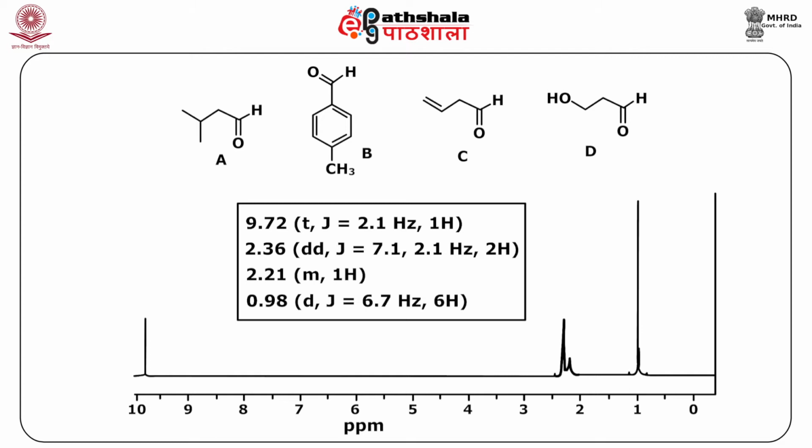Question number 2. Match the 1H NMR spectra with one of the substances. There are a number of structures given, and what we have to identify is which structure actually matches the given NMR spectroscopic data.